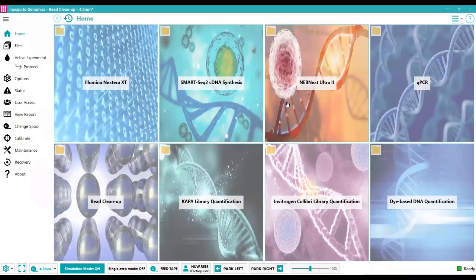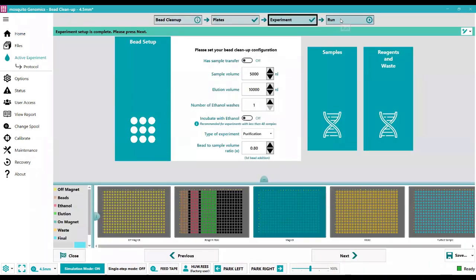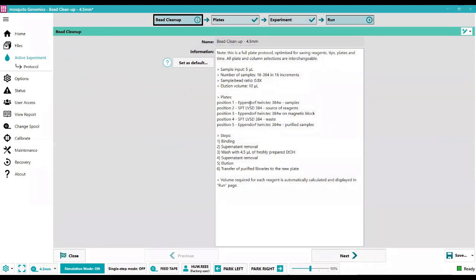After the initial library preparation and end preparation of the DNA, we need to clean up the sample using a bead cleanup. The Mosquito software wizard facilitates writing bead cleanup protocols from beginning to end. Unlike the library preparation, in the bead cleanup experiment you have to move the plate on and off the magnet at various points. The bead cleanup uses five plates: a sample plate, a reagent plate, a position on the magnetic block, a waste plate, and an output plate for purified samples after elution.